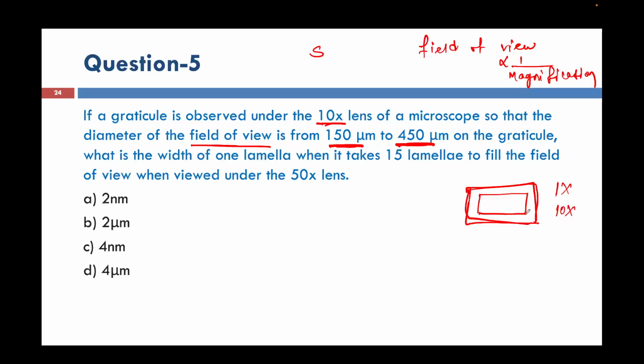If I increase my magnification to, let's say, 20x, I will get distinct small features in my object, but I will not see the complete rectangle A, B, C and D. I might see, let's say, E, F, G and H, with small distinct features which I might not be able to see in 1x magnification. So that is what the field of view represents.